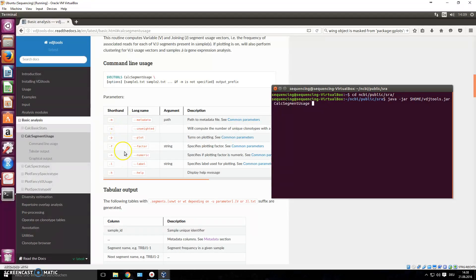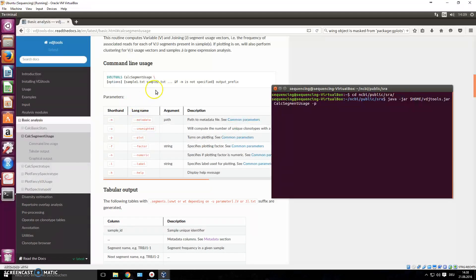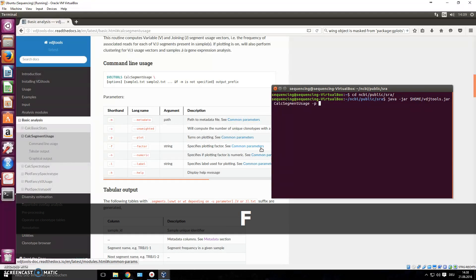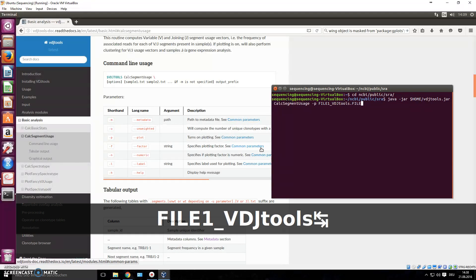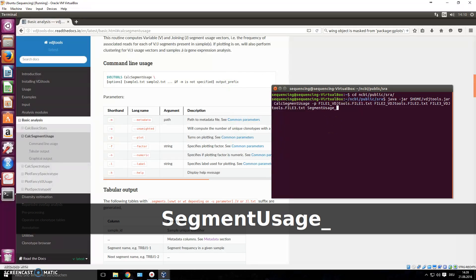Type in 'calc segment usage' and continue with options. The only option I want right now is '-p' to turn plotting on, because I want the plot and not just the tables. Now we input three files — file one, file two, and file three — and give the output prefix 'segment usage'. Press enter and you should be good to go.